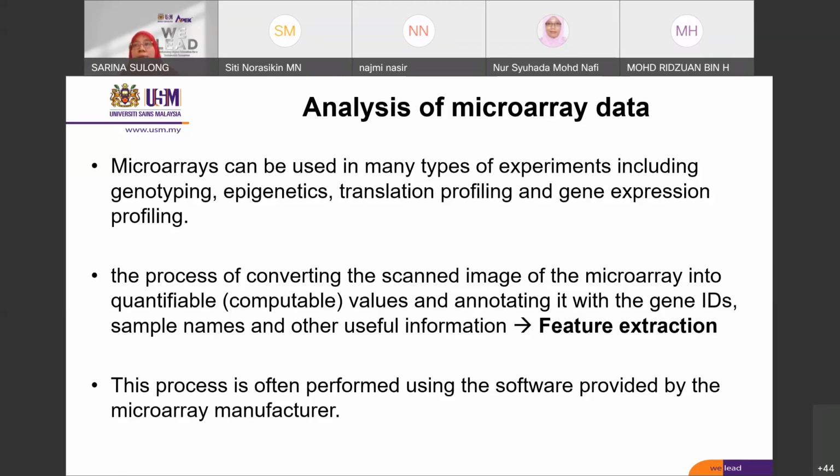And array manufacturers often provide software to open and analyze their raw data files, okay? And these programs also may not always be available because they may become obsolete after a few years, or may not be flexible enough for your needs. So there are several free software tools that are suitable for the downstream processing of the microarray files, okay? For example, we have the Galaxy platform, GenePattern, GeneSpring. GeneSpring you need a license to use, and also the statistical software R, okay?